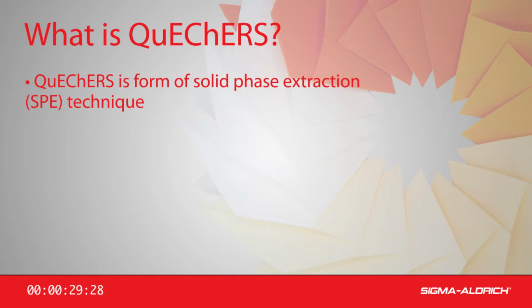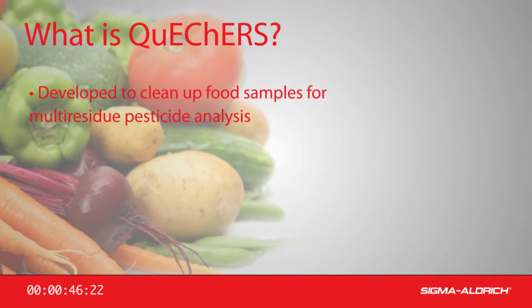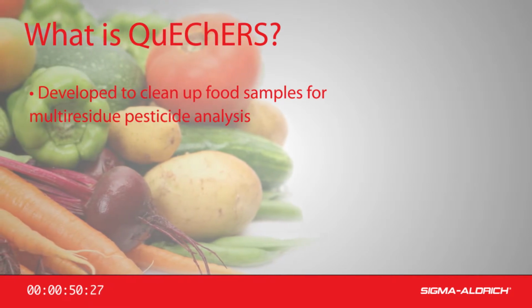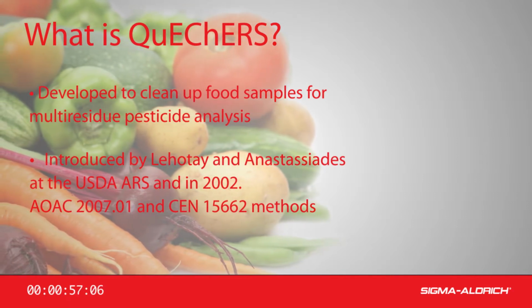In QuEChERS methodology, the use of loose extraction salts and cleanup sorbents in combination with shaking and centrifugation results in a quick, easy, cheap, effective, rugged, and safe sample cleanup. QuEChERS is popular for multi-residue analysis of pesticides in food, and this technique is now also being applied to other analyte classes. The concept was introduced in 2002 and is specified in official methods.